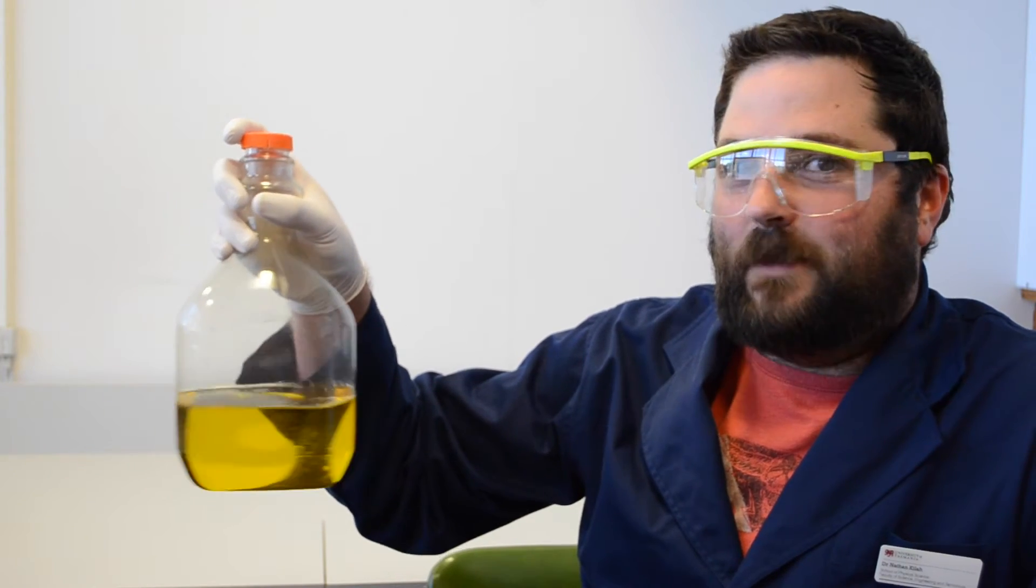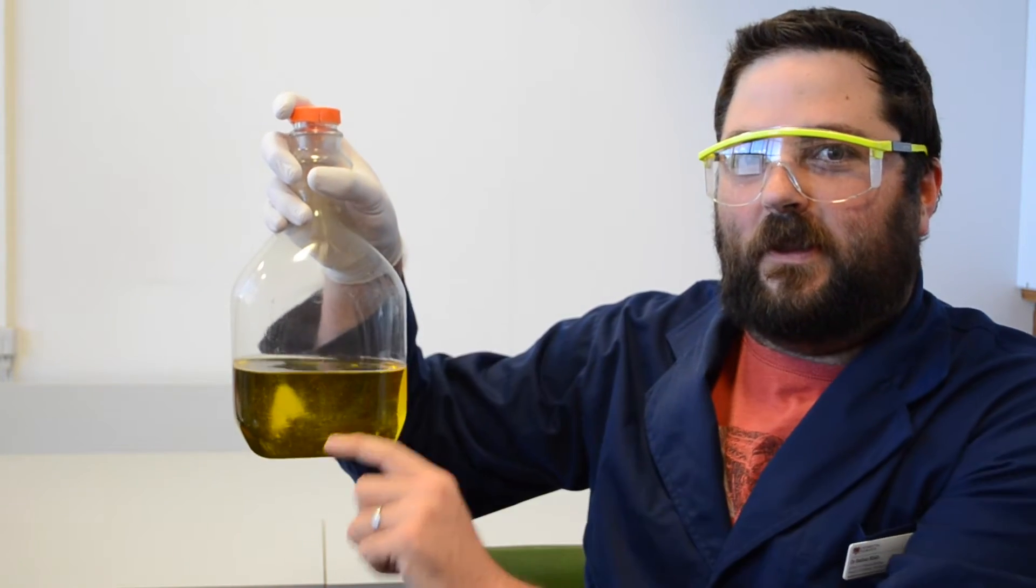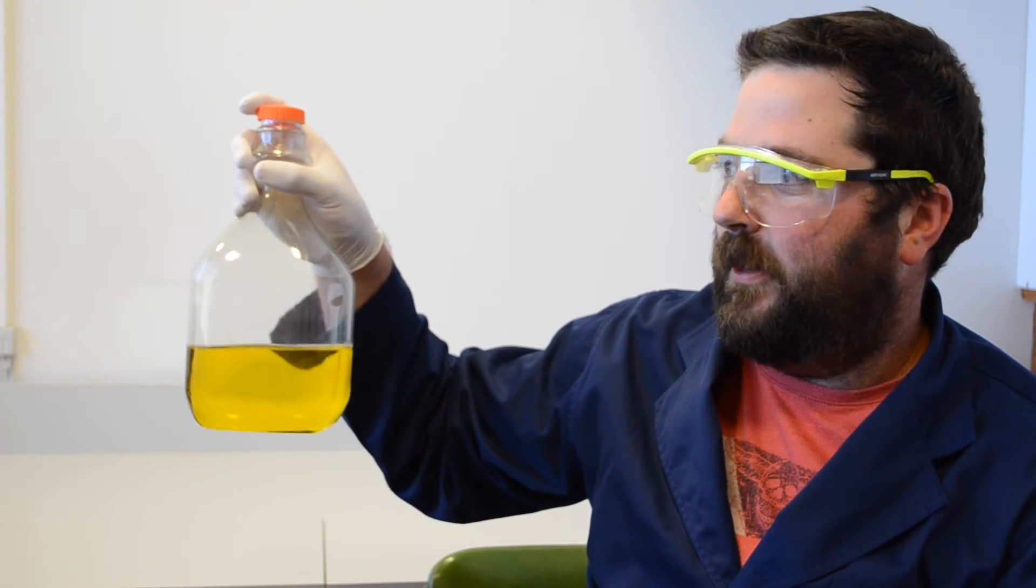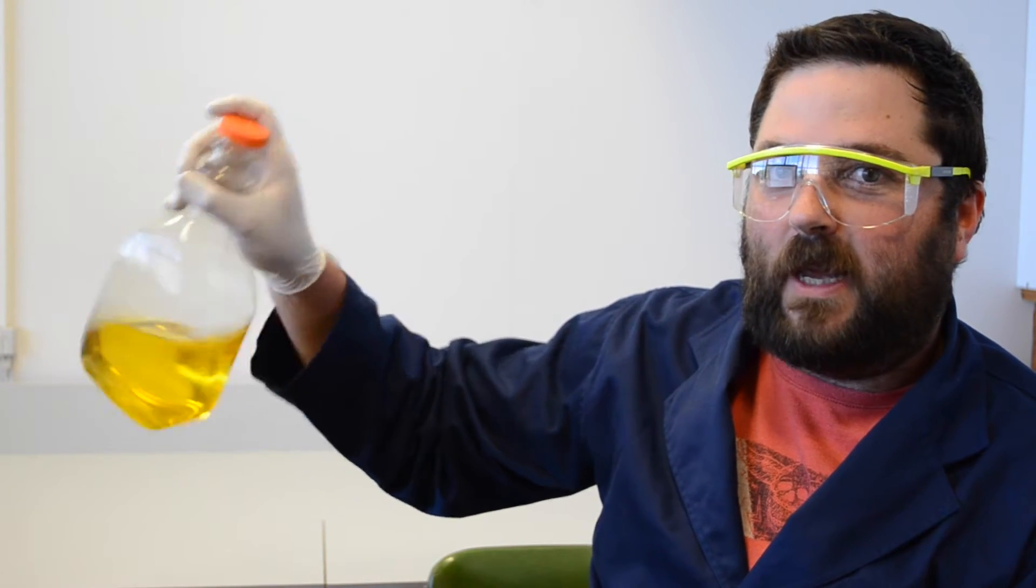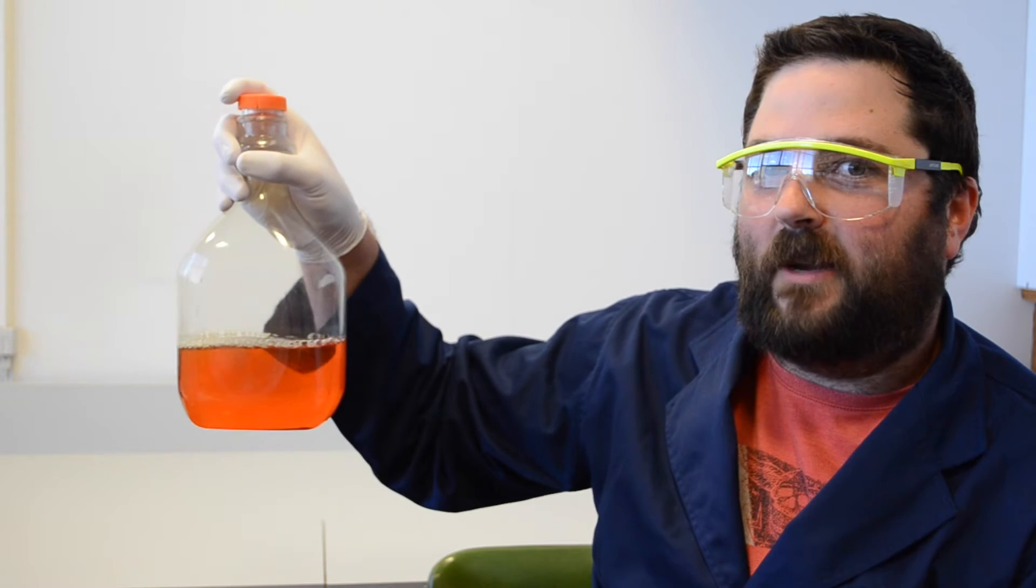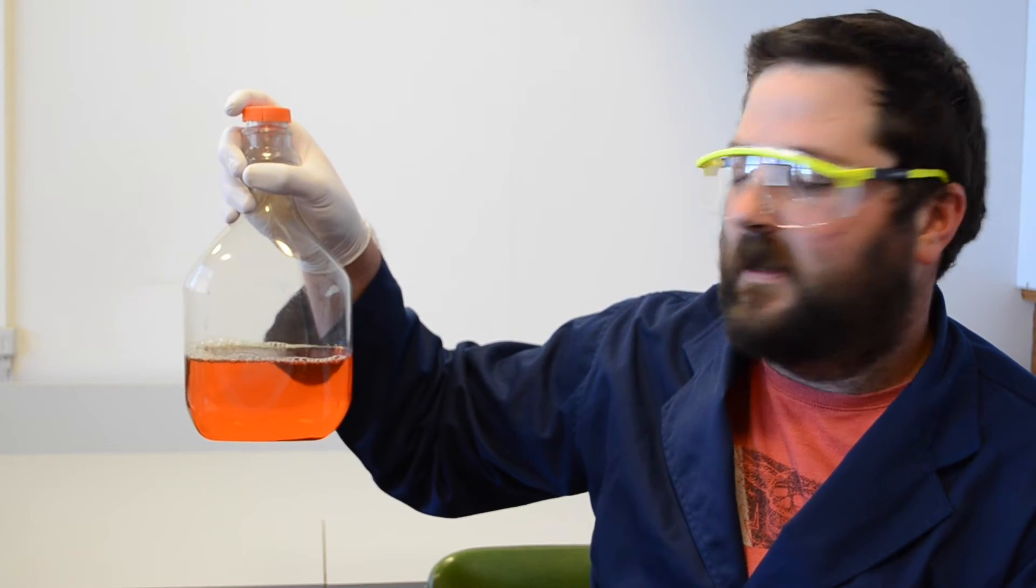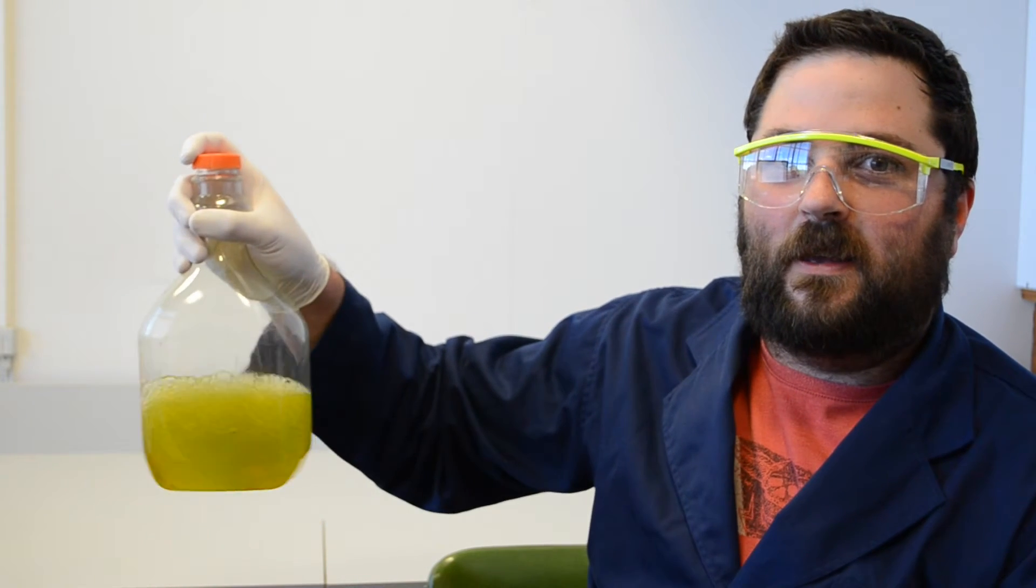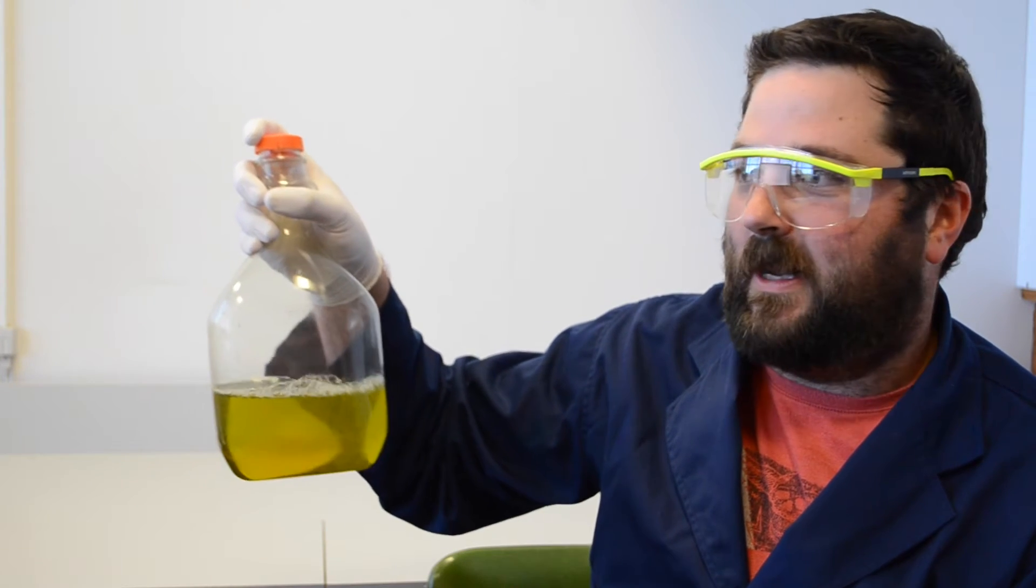Now as I shake the bottle, I'm mixing oxygen from above the solution into the liquid below. With a small shake, I mix in a small amount of oxygen, giving the red color. And with a larger shake, I mix in even more oxygen to give the green color.